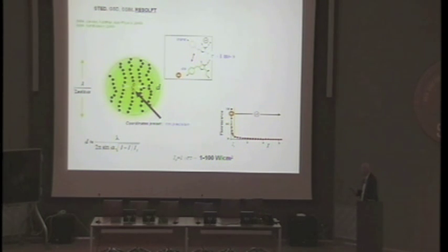And so I couldn't have called it STED. I had to give a different name, so I gave this name, RESOLFT. STED stands for stimulated emission depletion, and there's no stimulated emission in it.